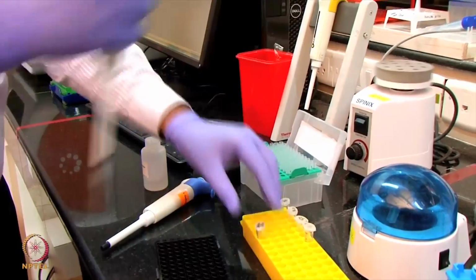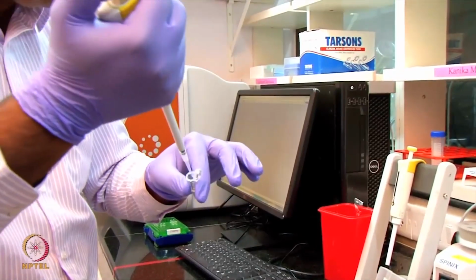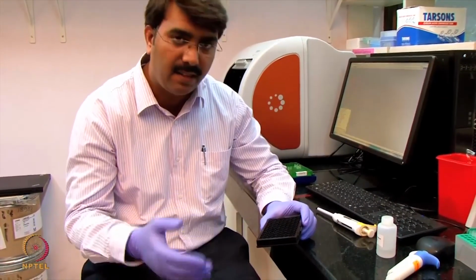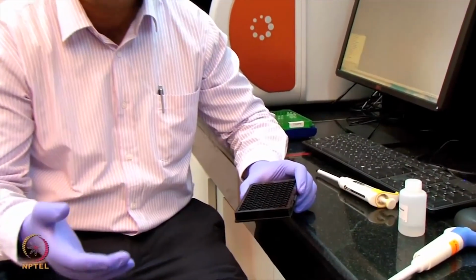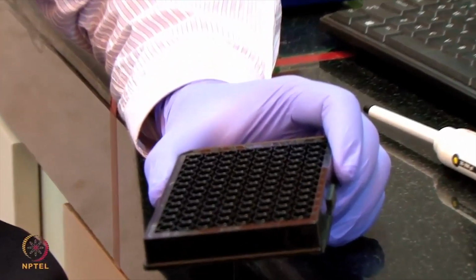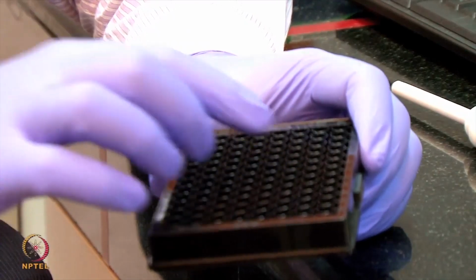Here, this is the 50 microgram per ml protein. I'm serially diluting, doing a two-fold dilution in the plate. So now we have made 6 concentrations of the standard apolipoprotein, ranging from 1.56 to 50 microgram per ml. I have put these standards, from 1.56 in A3 till A8, the last being 50 microgram per ml. I have also put a reference buffer, the buffer we are using for the reference subtraction, at B6, B7 and B8.